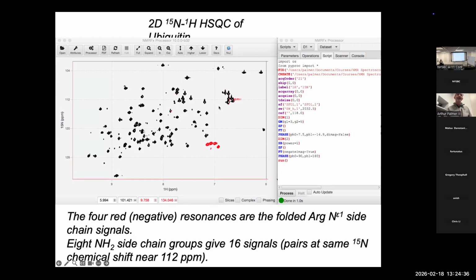the edges are connected. So if the top edge is, let's suppose, 100 parts per million. If these arginines are at 80, let's say, then they're 20 parts per million above our upper edge, which means they should appear wrapped in 20 parts per million in from the lower edge, because they just wrapped around, and that looks approximately right here.